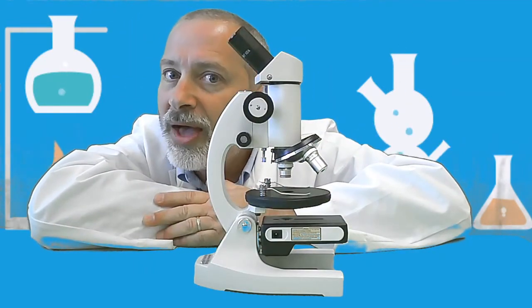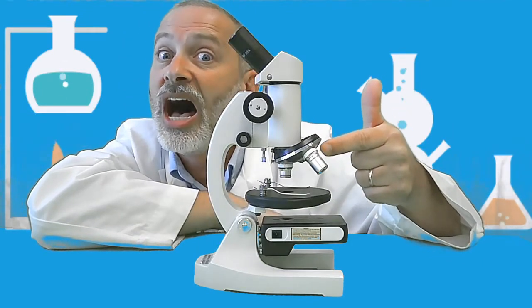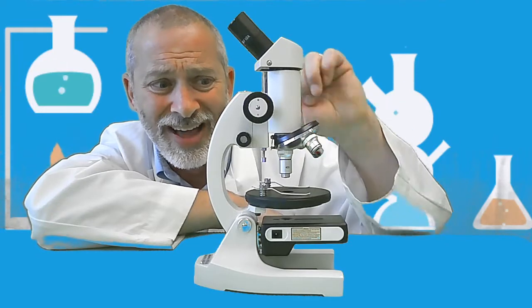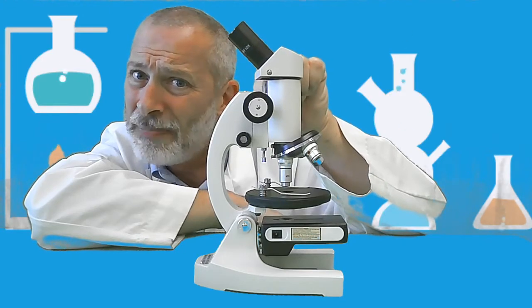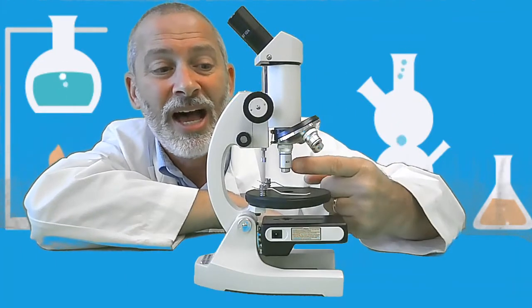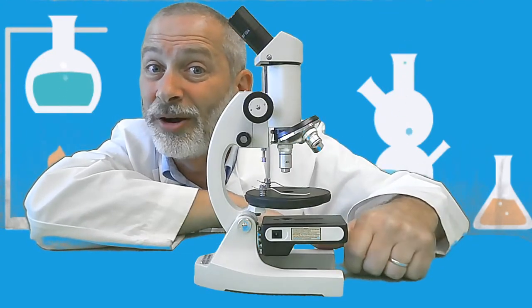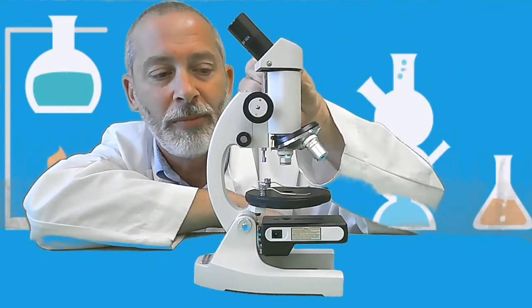Think about why that might be so important when you think about the length of the high power objective lens. Bad things could happen if you're starting on the high power objective lens and you lower the body tube all the way down. I'm not going to do it because you might crack and break the high power objective lens. And believe it or not, this little part here is the most expensive part of an entire microscope. So be careful. Always begin using the low objective power.